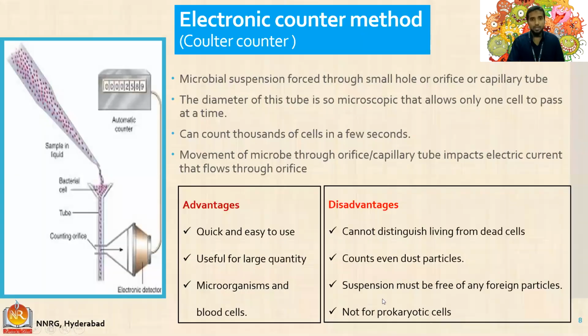The next is the electronic counter method. In this, we use electricity. Basically, electricity is used, and for that reason it is called the electronic counter method. We'll see why it is called a counter method.